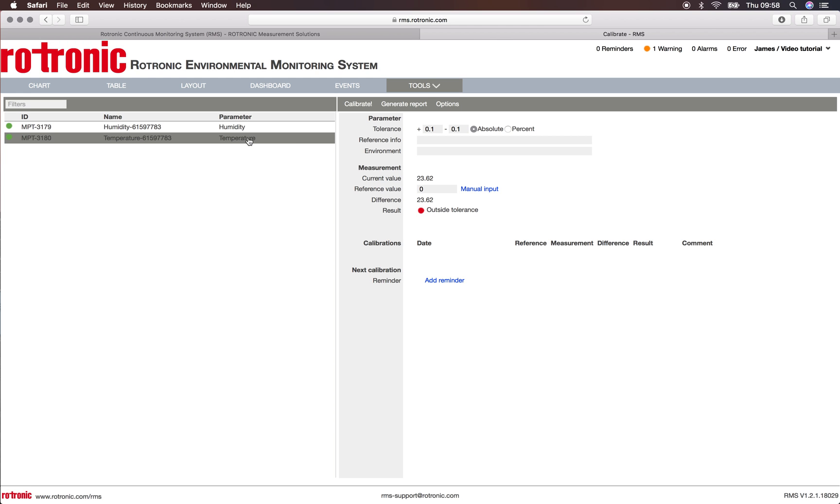If we calibrate the temperature, we have the possibility to put the tolerance. Based upon your SOPs, you can add your tolerance. Let's say here 0.5, and this value can be either an absolute value or a percentage value.